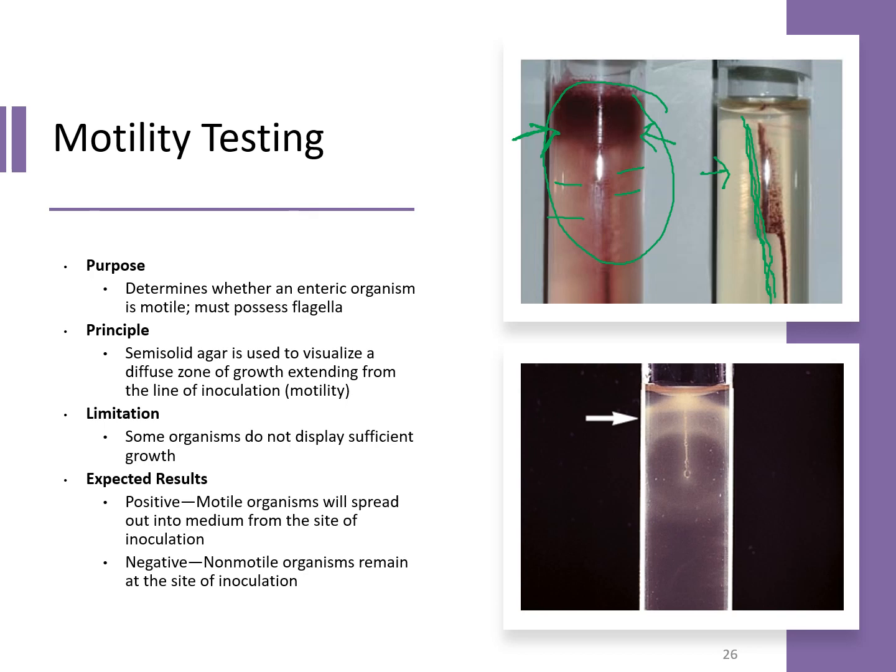And then of course here you have that umbrella motility from that Listeria. So you can see where it kind of forms that little circular type appearance here up top, and then you have that stab mark that comes down and creates that little umbrella look to that organism.